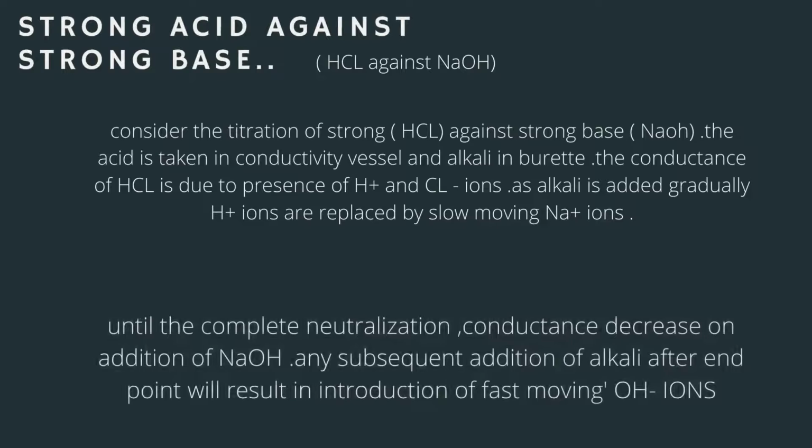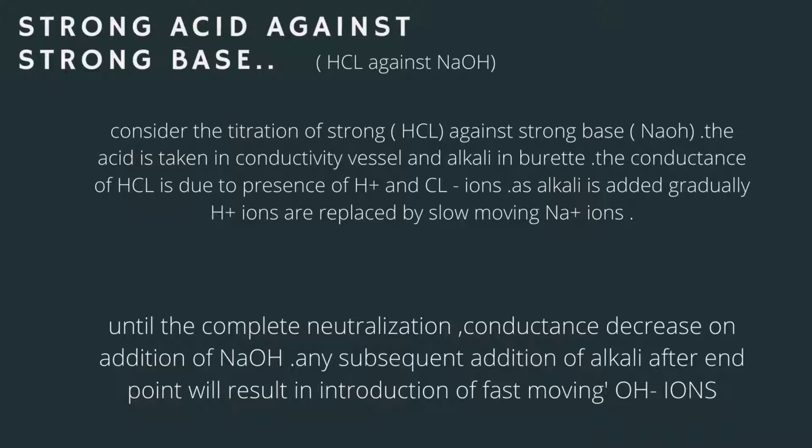My first example is strong acid against strong base, HCl against NaOH. It means hydrogen chloride against sodium hydroxide. Consider the titration of strong acid HCl against strong base NaOH. The acid is taken in a beaker and the conductivity is measured, with alkali in the burette.